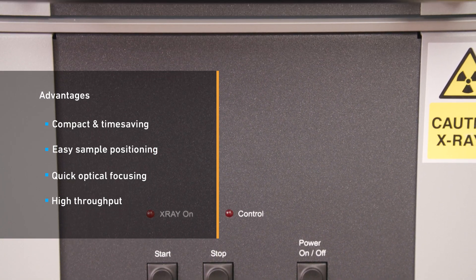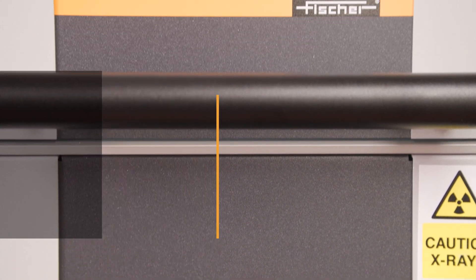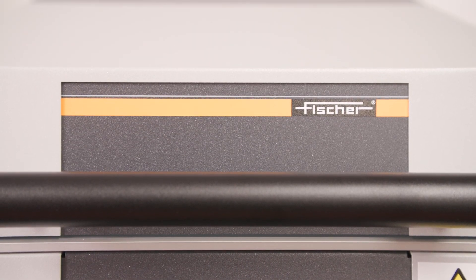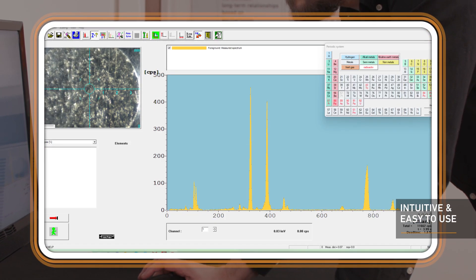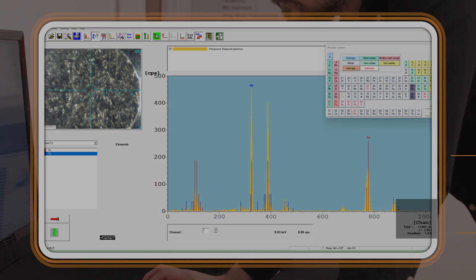Optical focusing is quick and easy, without the need for physical adjustments. It is ideal for high throughput and small batch sample analysis. The instrument has easy-to-use software, enabling powerful reports laid out in a simple way.